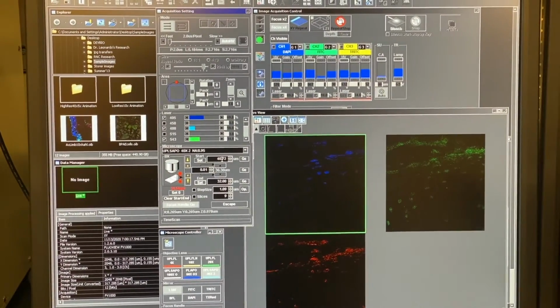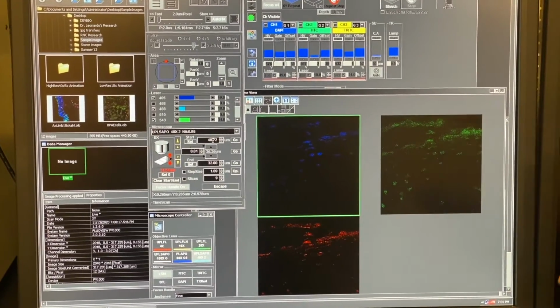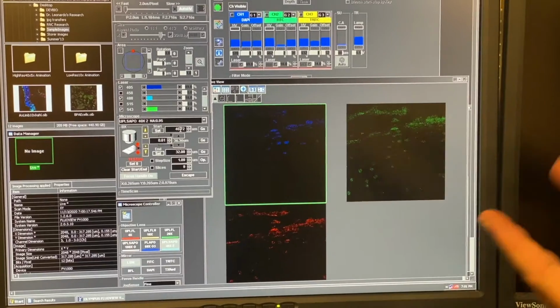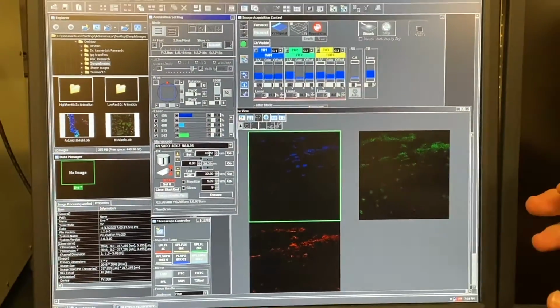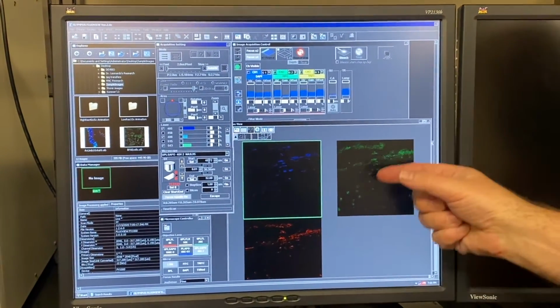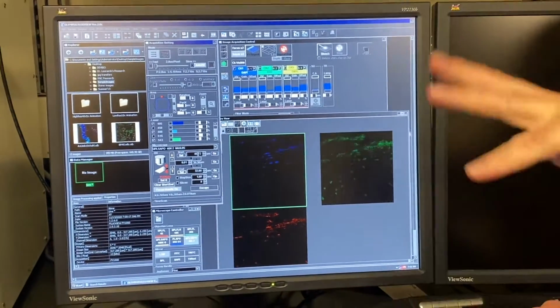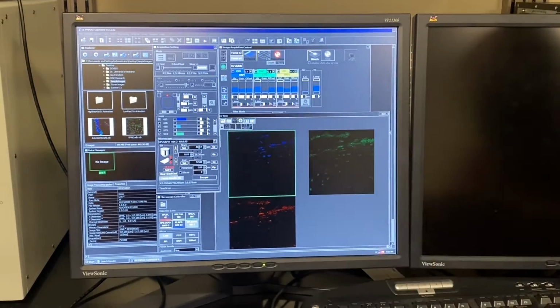But didn't I cut the sections at 20 microns thick? I sure did. What happens is, on the cryostat, we take this piece of tissue and we attach it to the glass, and then we dry it, we bake it. What happens? The cells shrink. The other thing that happens is we wash antibodies over it. But antibodies have a hard time penetrating more than 10 microns thick. So the tissue might actually be there, but we don't see any staining because it's so deep down attached to the glass that when we washed antibodies over the top, they never penetrated all the way to the bottom. So we couldn't see it because there's nothing glowing.